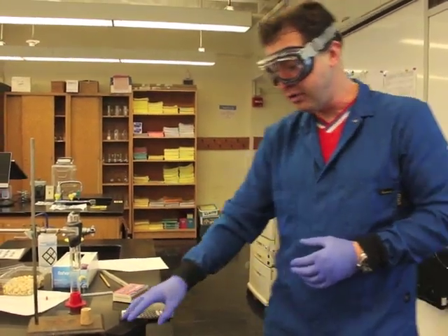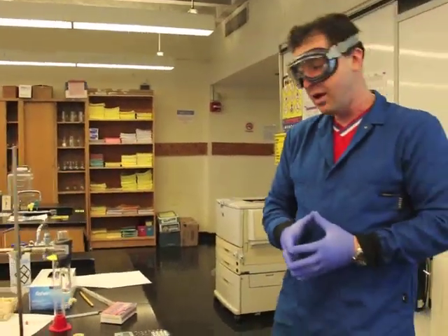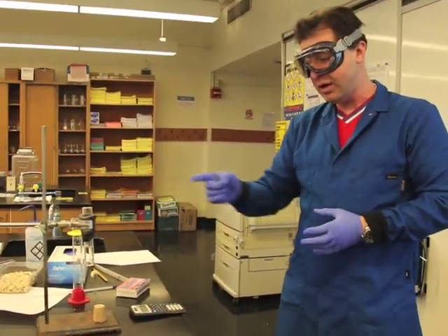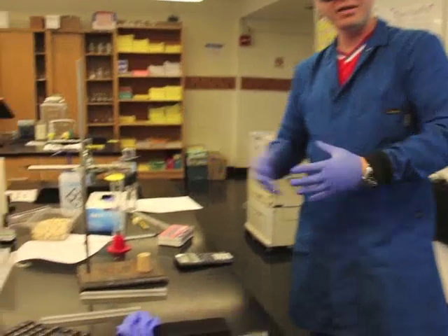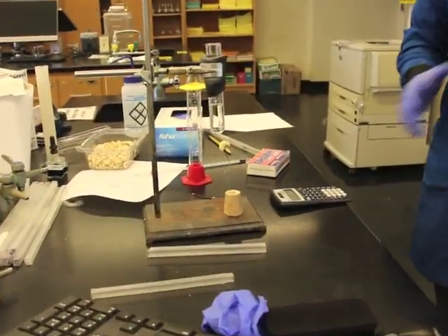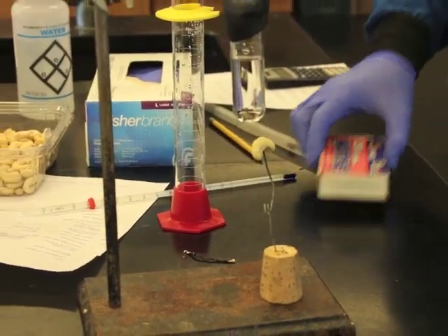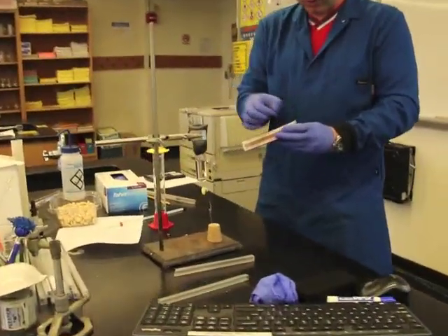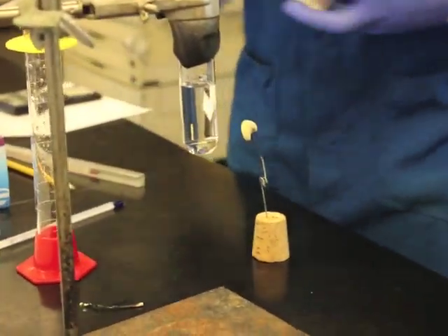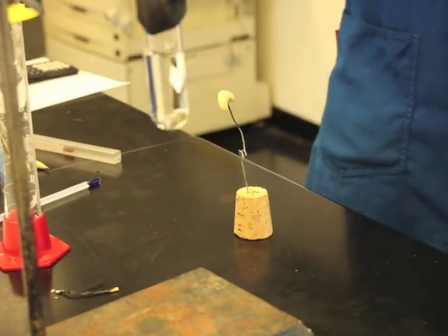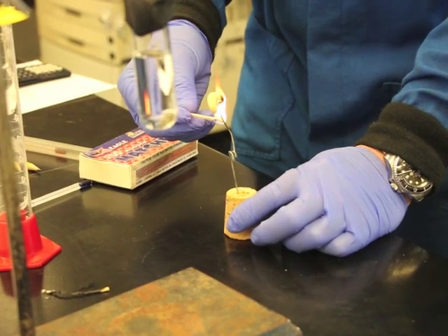This is a crude calorimeter because the entire surroundings is open, so we're going to lose a lot of heat to the surroundings, but we'll still get some crude data for the energy content of this cashew nut. I'm going to remove this from the bottom of the water because if I don't, I'll introduce additional heat from my match.